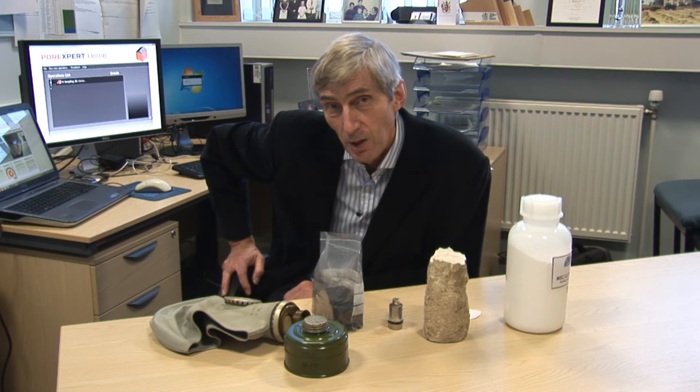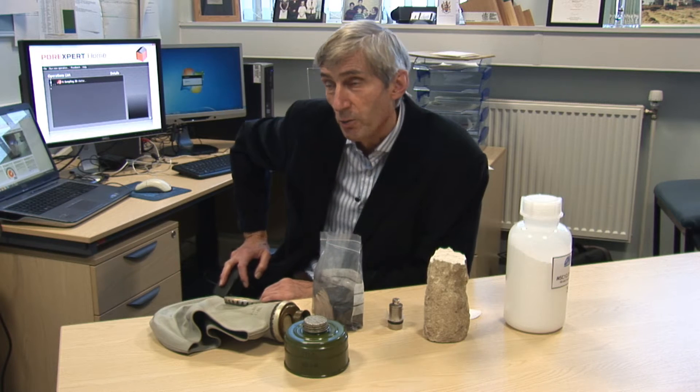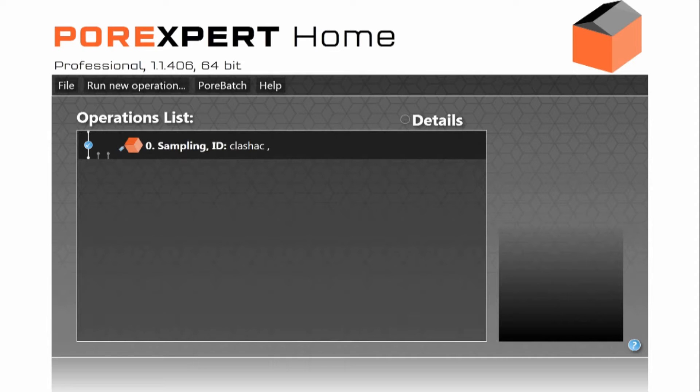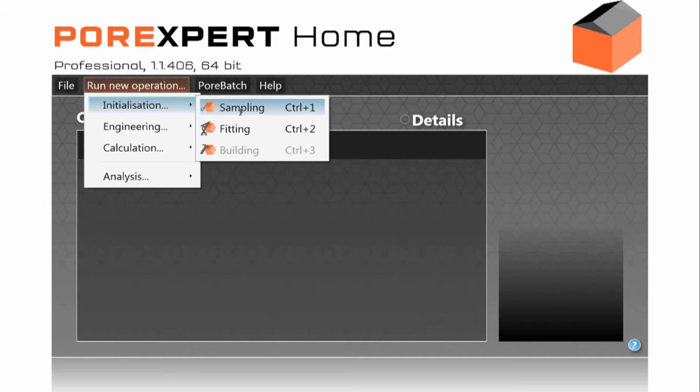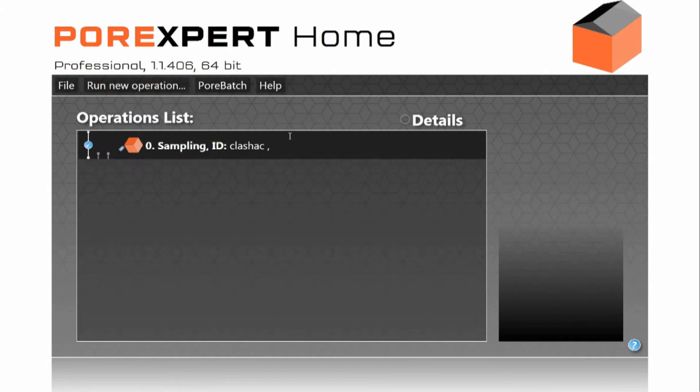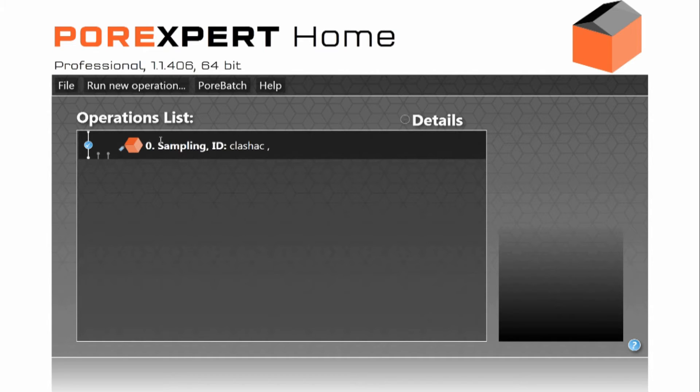So let's have a look at the software. So first we run an operation called initialization sampling. And this is to load your experimental data file. The one I have loaded is one of many examples we give you. This is Kleshak outcrop sandstone and it's probably one of the simplest ones to model.